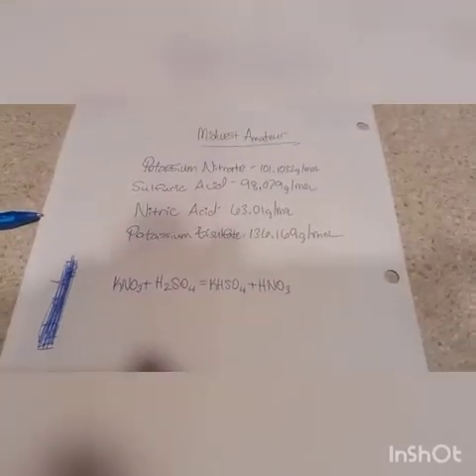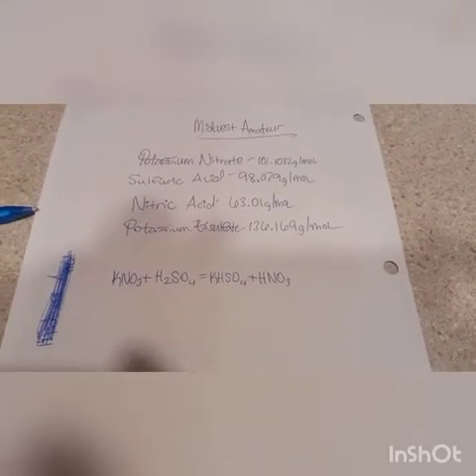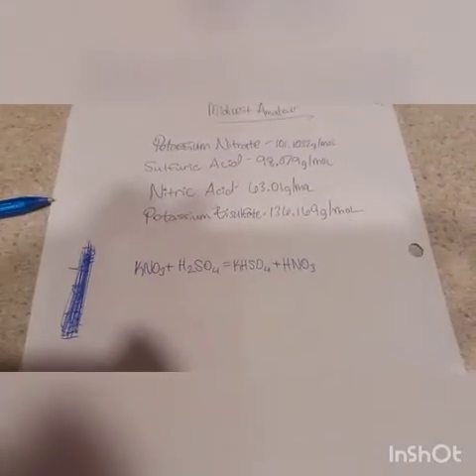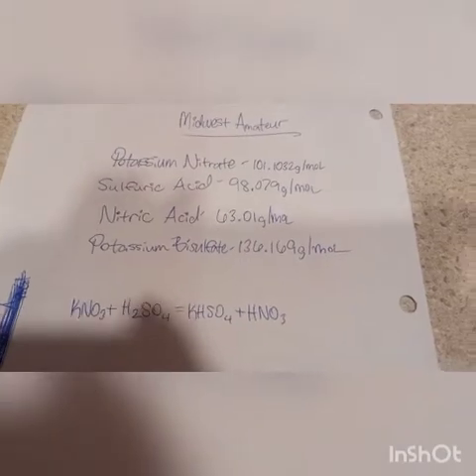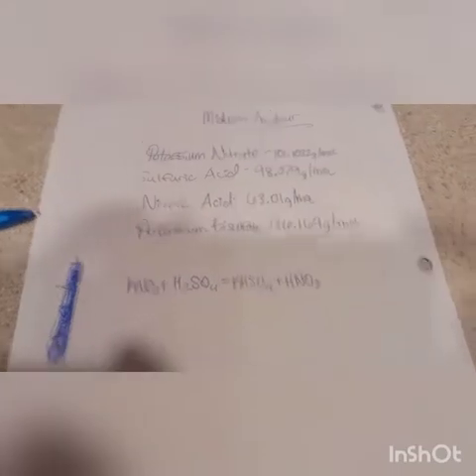So this is my first video, nitric acid. Been done to death and a half. But it's always nice to do because nitric acid is such an important reagent. It can be used to add nitro groups to aromatics like toluene, trinitrotoluene. So things like that can be made. You can also just make nitrate salts. You can dissolve lead in nitric acid. Certain things like that. So we got potassium nitrate.